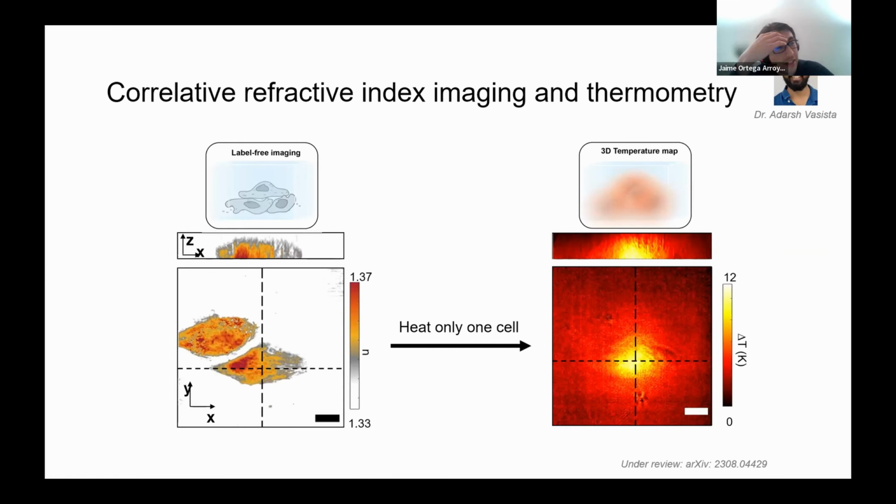Yeah. So I'll answer the second question because this is the freshest one. So the time dependence, yes, you're right, because as you wait for the wedge prism to move, you're assuming that your system hasn't moved spatially, in this case, a cell hasn't moved or changed considerably, so that when you take the pump on minus pump off, the only thing that you're measuring is the changes in temperature. And all the systems I've shown are in a way static, so that you can go through multiple pump probe cycles, or multiple pump probe cycles combined with the rotating of the wedge prism, and this remains the same, right?